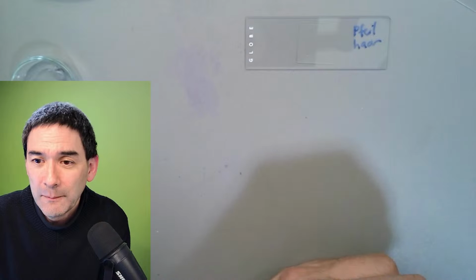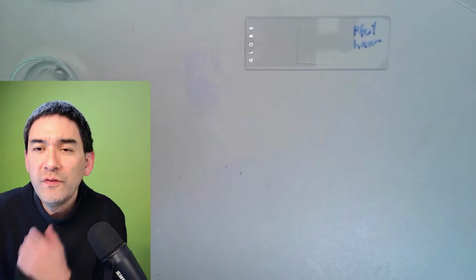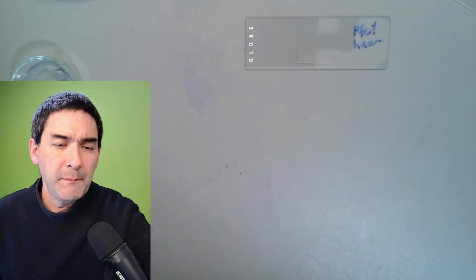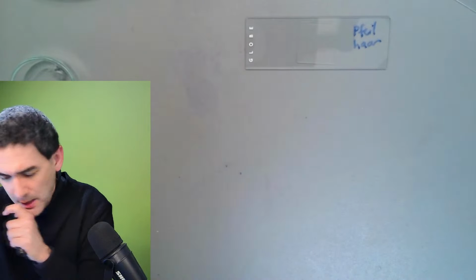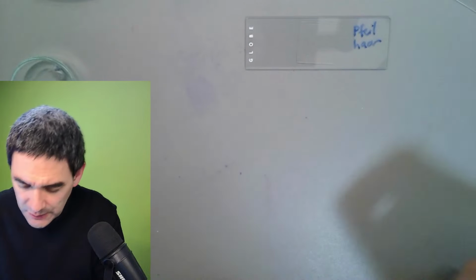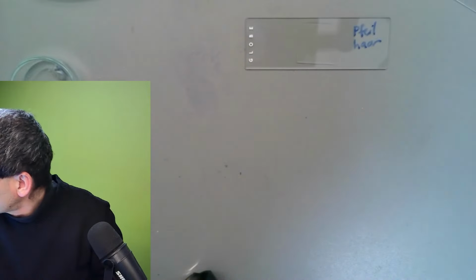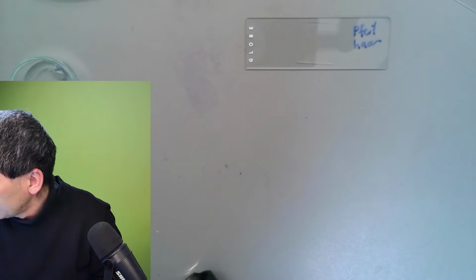Let me quickly check again. Otherwise, can you test UV reactivity? That's an interesting one. I do have a UV lamp. I don't know, honestly, thank you for asking. I'm just going to try it. I guess I'm just going to use any old fibers.